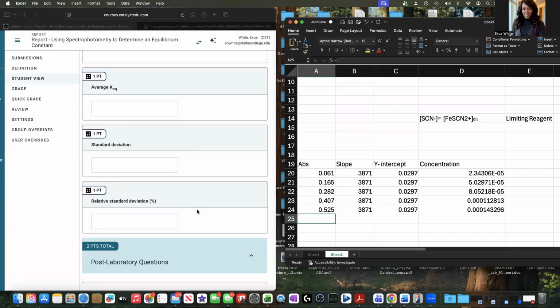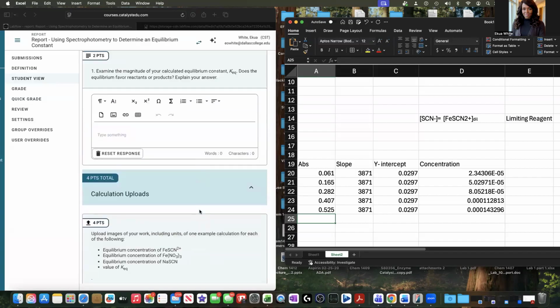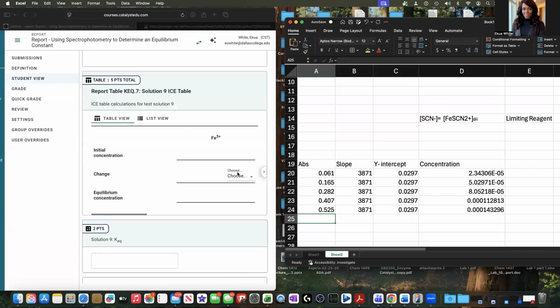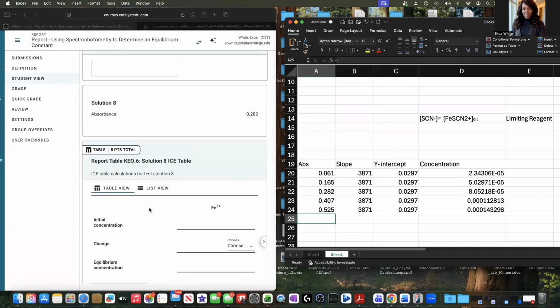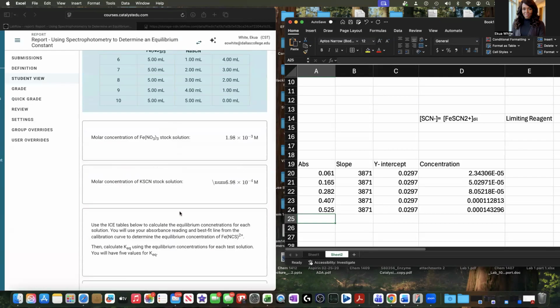It's a little bit less overwhelming because, oh my goodness, when I was doing this earlier, I was like, this is a long video. Okay, so you can see how I just got the concentrations here, right? And these are the amounts that we have at equilibrium. Okay, now this part is a little touchy, so I'm going to go ahead and plug these in here, but I can't do this yet. Let's go back to experiment 6, which is where we left off.